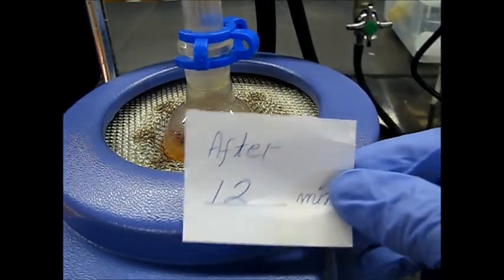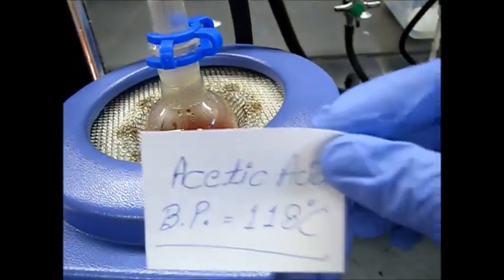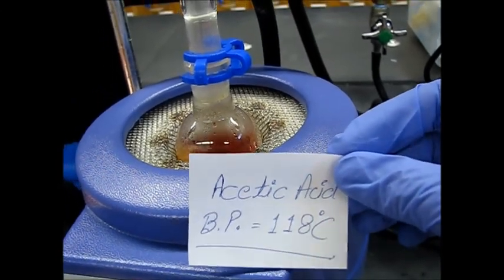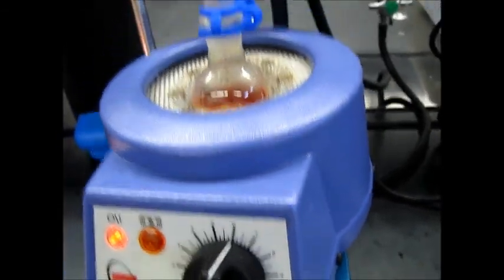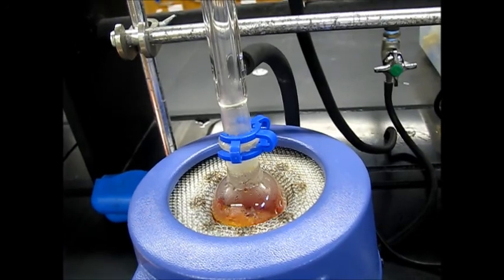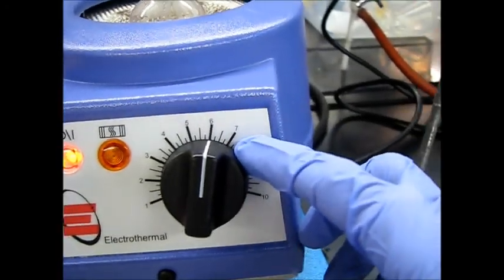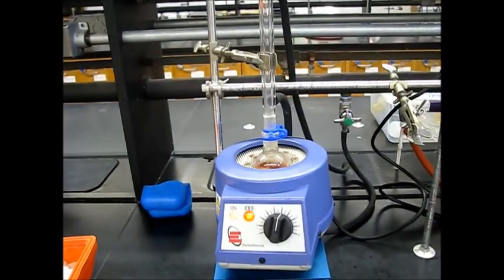So here you can see after 12 minutes, this acetic acid solution started boiling. And acetic acid has a boiling point around 118 degrees Celsius. So we'll boil for 15 minutes. And right now the heating knob is around 6. So we'll keep it as such. We'll come back after 15 minutes.